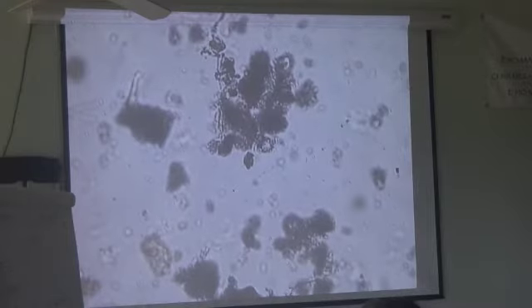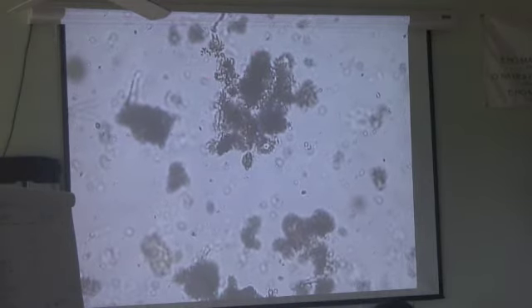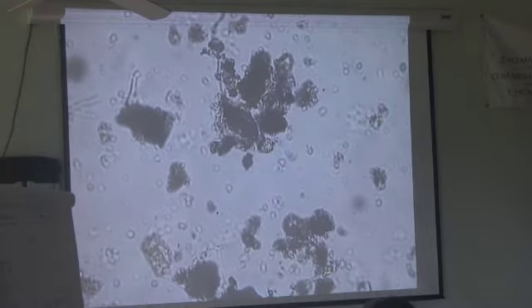Okay, so now here's our first field. First off, there's a fair amount of bacteria, so we're going to wait to count our bacteria until we go up higher in dilution. So that's a bacterium. See how that bacterium, when it's moving, tends to go in one direction and then turn around and be sharp. So motile bacteria is a different species. There's a ciliate. Did you see it over in the corner? So now we record a ciliate for this field.